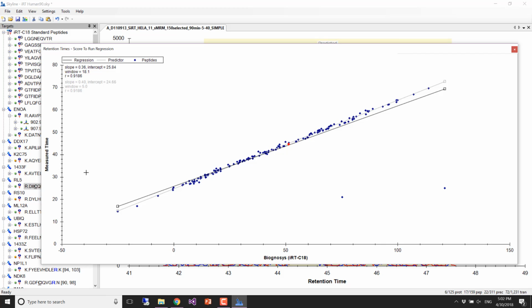But yeah, it's worth understanding, and certainly you can save yourself some money on standards if you understand it really well. But there are standards that you can inject and save yourself some time. And there are a fair number of labs that I meet now that just inject some kind of standard into every sample they ever process, so they have this way of normalizing the retention times.